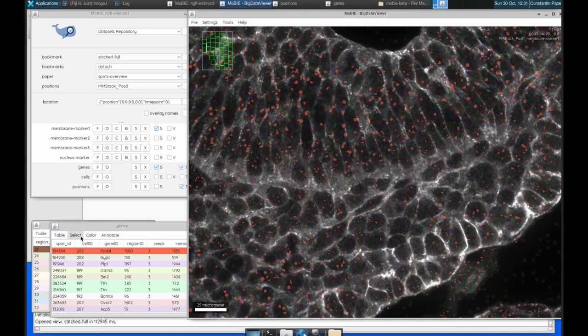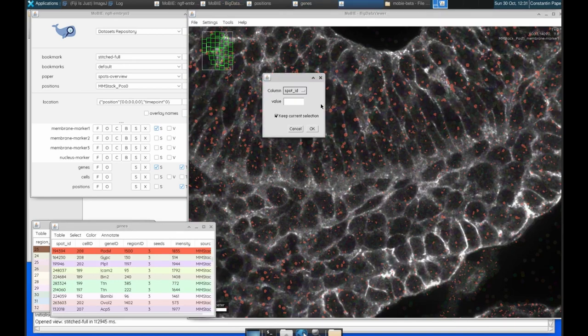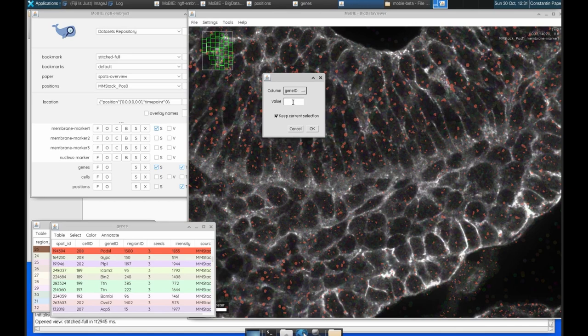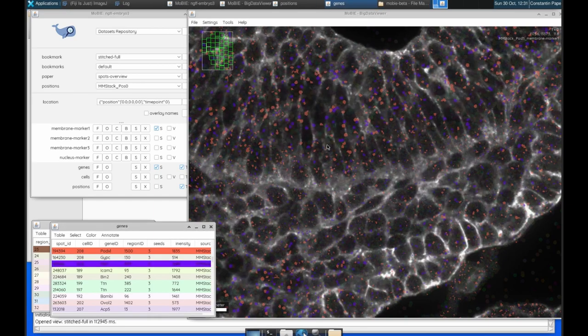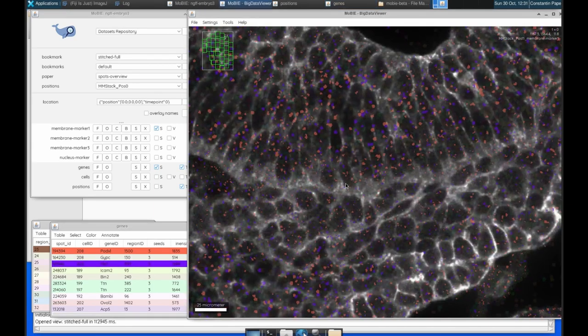So let's do one more gene. We can again go select, select equal to, find the gene ID column, and we can type in a different gene name. So we can use this PLP1, click OK. And now every spot that has that gene ID is shown in purple.